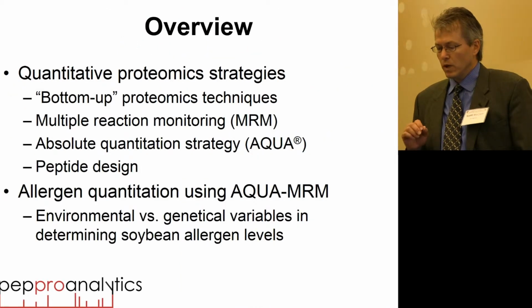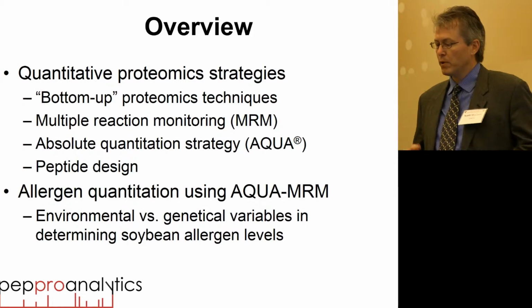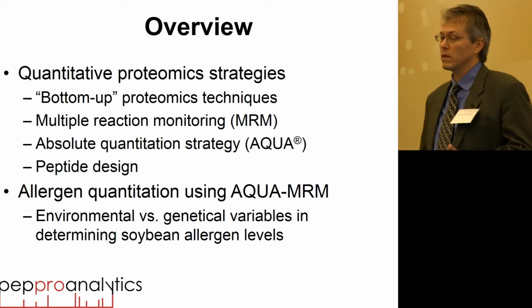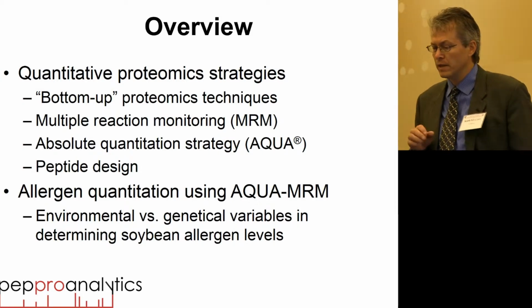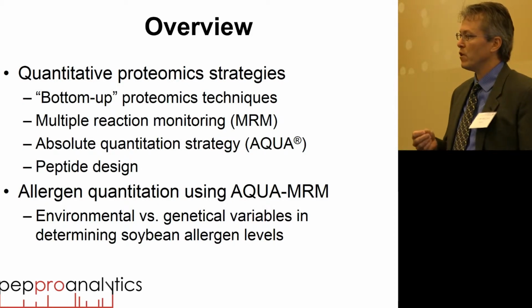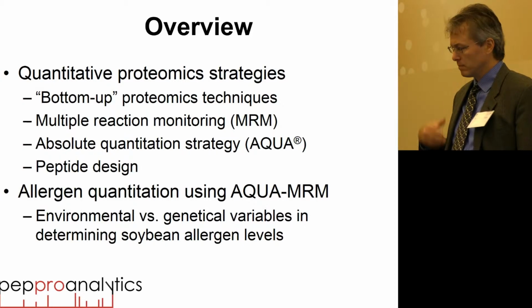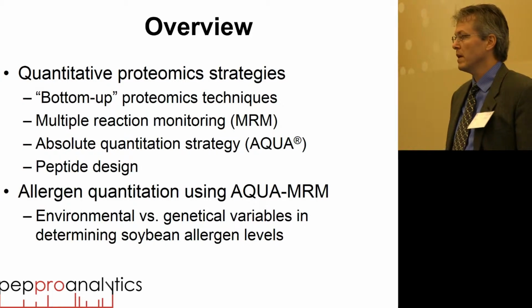And so what they wanted to do today was really show you this bottom-up approach to proteomics techniques, and the PATC has been working with him for quite a number of years now. And really taking a look at the mass spec methodology was an outgrowth of knowing that the EU regulators were highly interested in having something to measure endogenous allergens with.